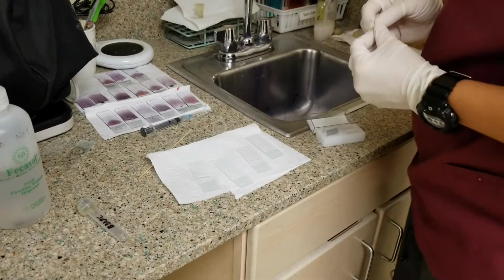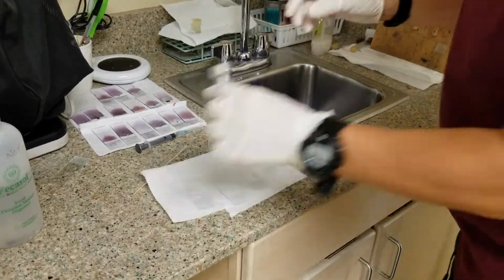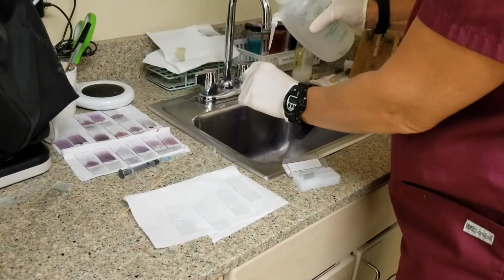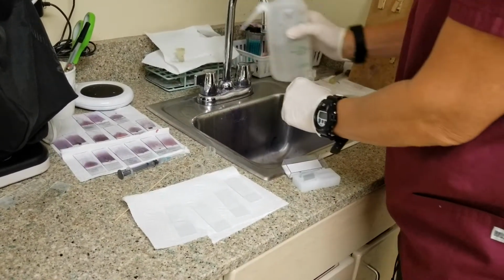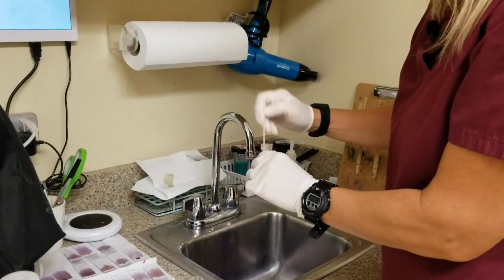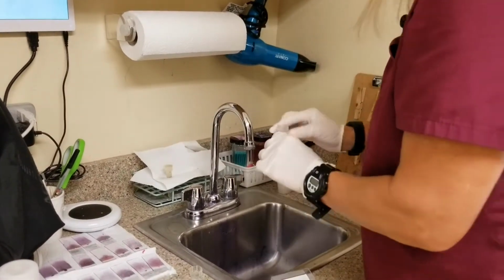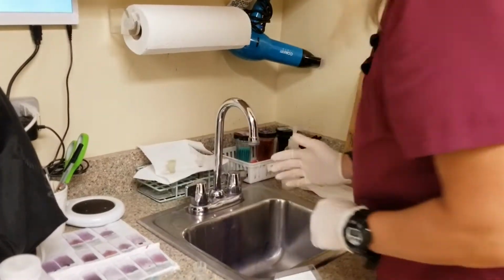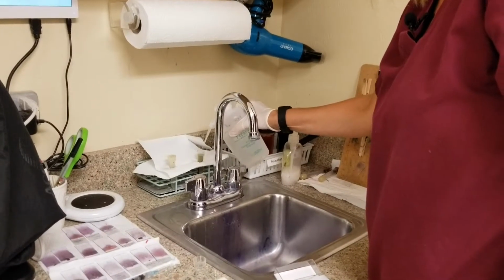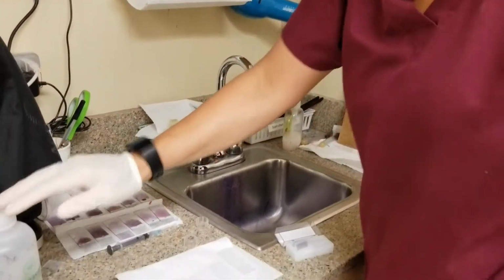I can just drop a cover slip directly onto these and go ahead and immediately read my directs. So Missy, what would be the benefits between doing a direct versus a float? So the float will actually bring more of the ova or eggs to the top. On the direct, you may see the live larvated strongyle moving around. And there's other eggs that you can see better with the float. The float should bring up more of the eggs because of the salt in the float material.